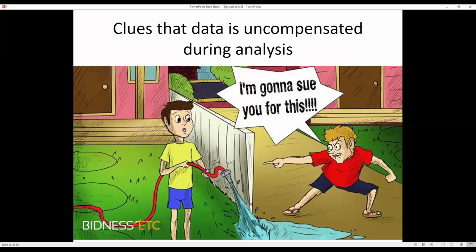My question is, when you want to do an unstained sample, unstained means you take the cells, no fluorochromes added, just run in the machine. For what purpose you check that? Dr. Gautam is saying for APML internal cases. Negative control also. Or autofluorescence control. Dr. Mohammed Bilal is also saying APML is known to show autofluorescence. The word is autofluorescence.